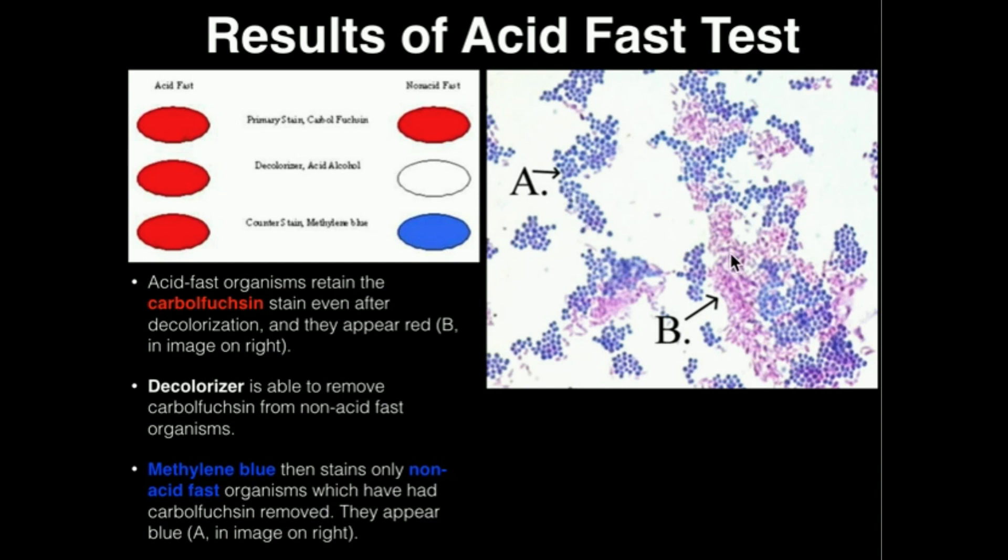Here's a slide depicting a mixture of both of them. Here is A right here. We see blue anywhere where we see blue, so that is going to be a non-acid-fast organism. If we see where we have the red, which here's a good example right here, B, that's going to be an acid-fast organism.